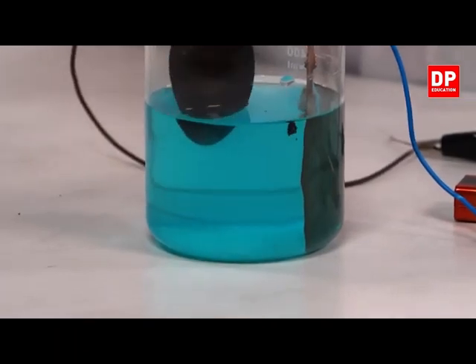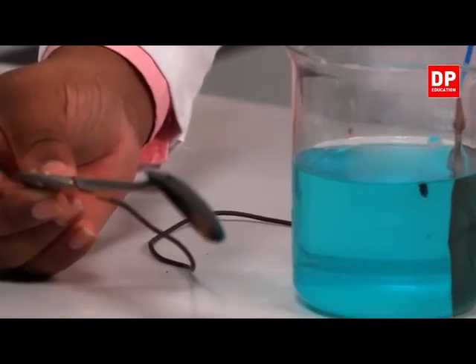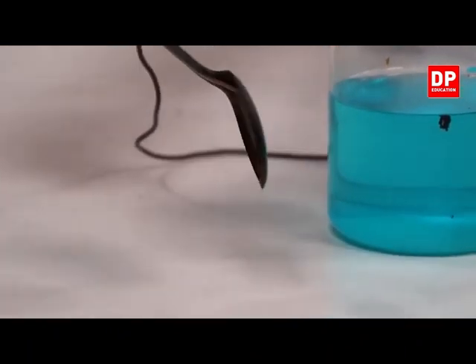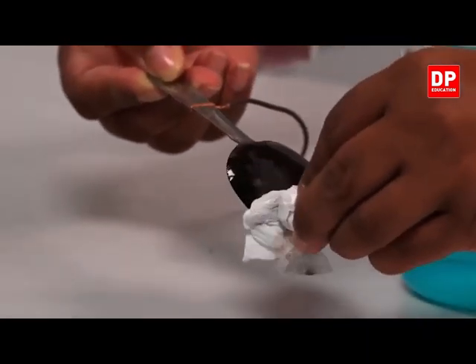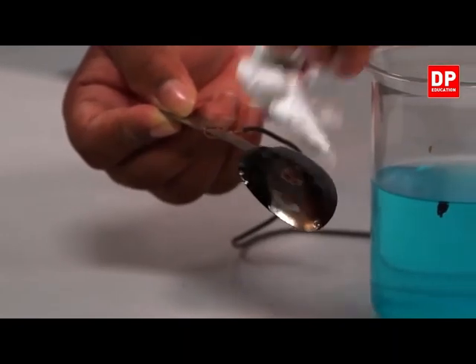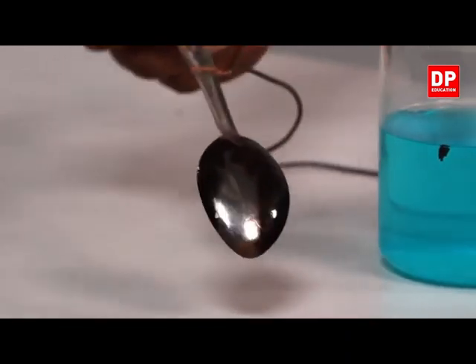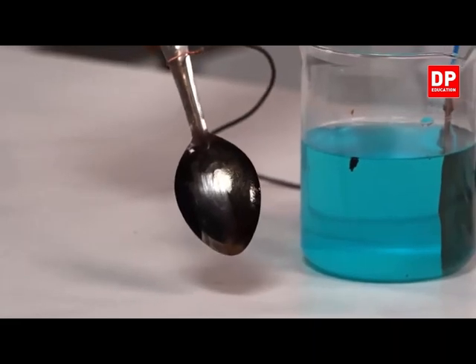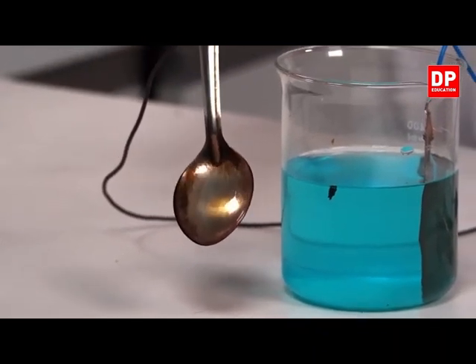Right, so I'm going to take it off and you can clearly observe once again there is copper around the spoon. See? I can remove it using this. So there is a clear stain. You can see it very clearly. There are two different colors.